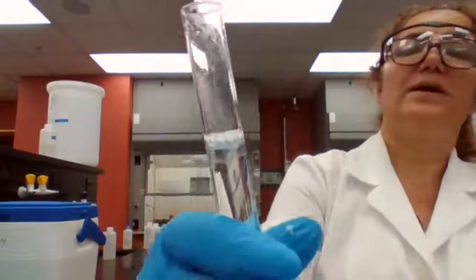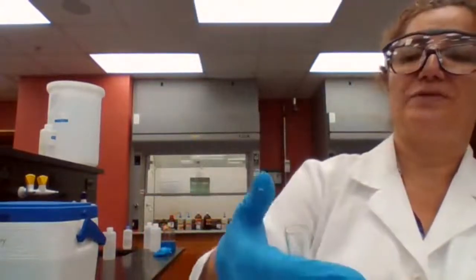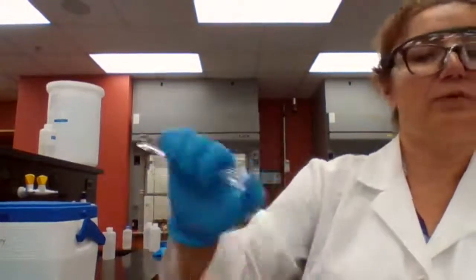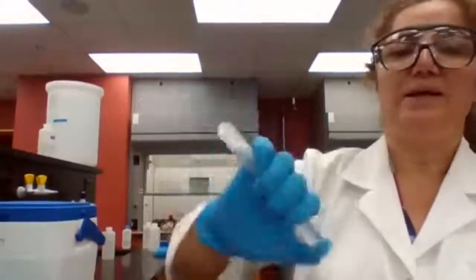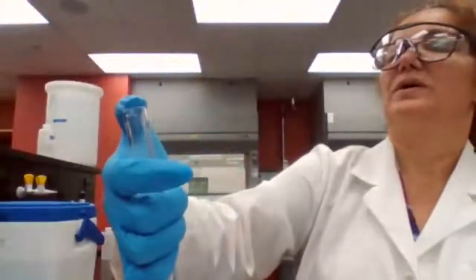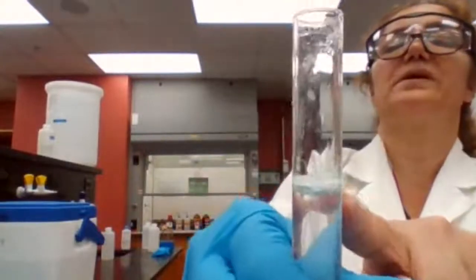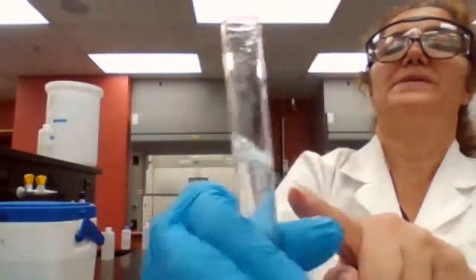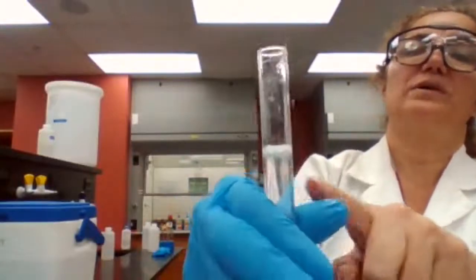That's why it still is not dissolved, but I'm going to save it and show you before we leave the lab today. It is reacting and it's still forming bubbles on top. That means it still is reacting, but it's much less than what I started with.